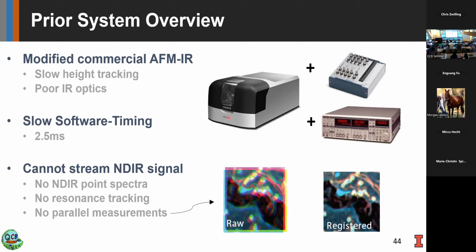So this is showing what the bands look like after imaging, separated each band by approximately 3 hours to collect a single image. They drift quite significantly, approximately hundreds of nanometers. So our image registration can actually improve that and bring them together to form a nice composite, but pushing the resolution down further, this will eventually be a limitation of the system.